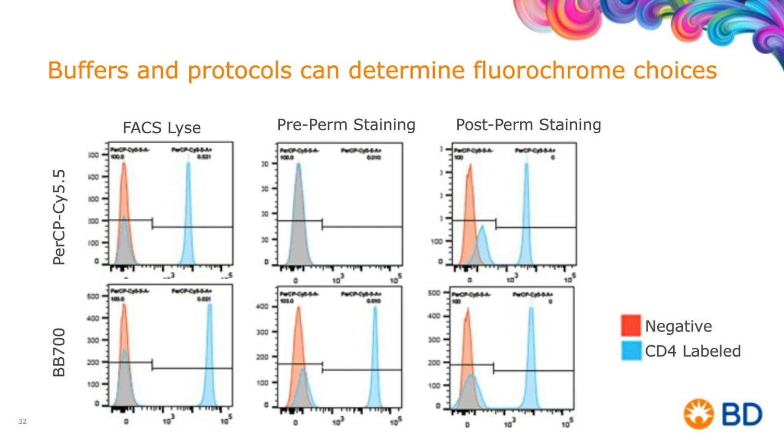But also on the Brilliant Blue 700, a little bit of change there because it did have an impact on the intensity of color. So again, knowing about these colors and their impacts are truly important to everything that we do. They're just part of the fundamental approach that we have to look at when we're doing panel design.